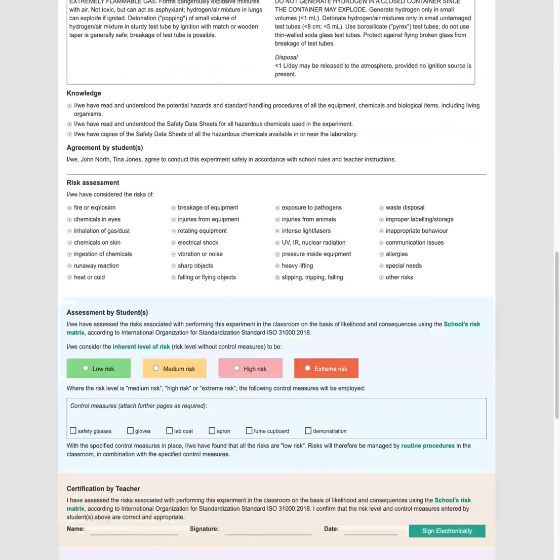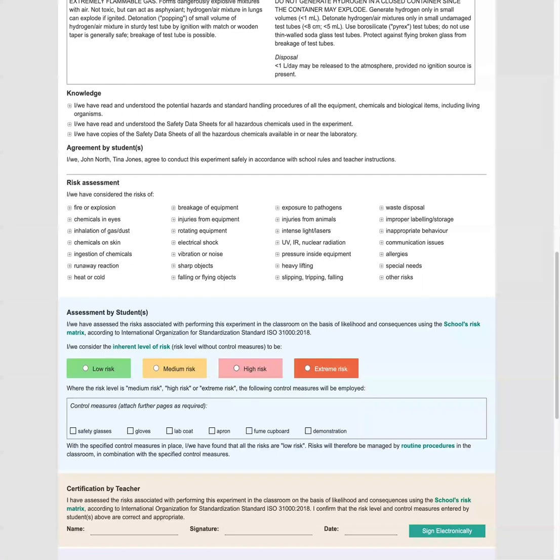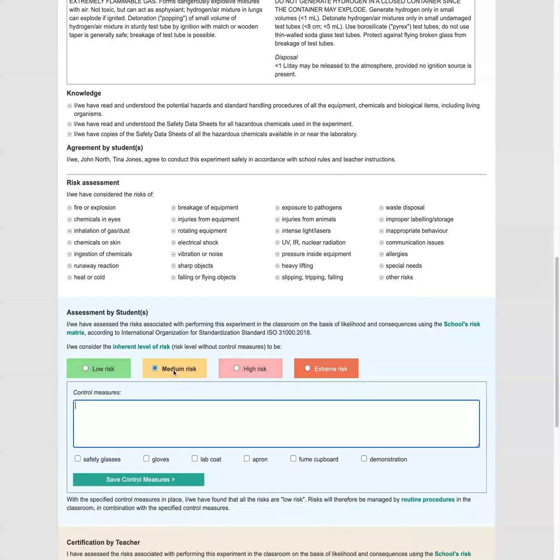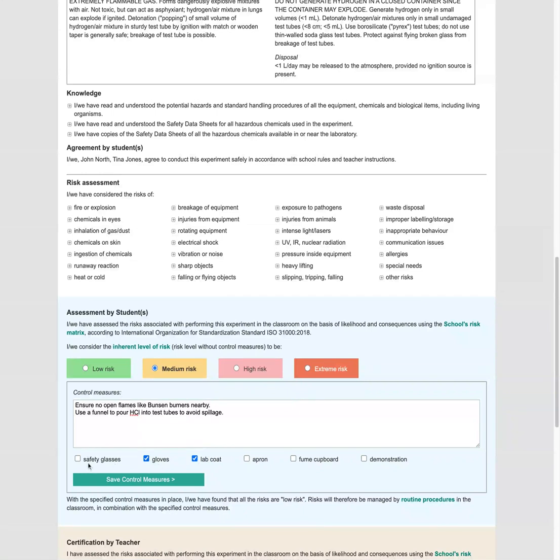So for any activity where the risk level is not low, control measures must be put in place to lower the risk level to low risk. The idea is to introduce enough control measures so that the risk level for the experiment with the control measures in place is reduced to low risk. So let's say that before control measures, the risk level is medium. Now let's pop in some control measures. So we'll say we don't want to have anything happening near open flames with the hydrogen gas generated. We'll use the funnel to get the HCL in so that we don't spill it anywhere. And we're going to protect ourselves with some gloves and a lab coat and safety glasses.